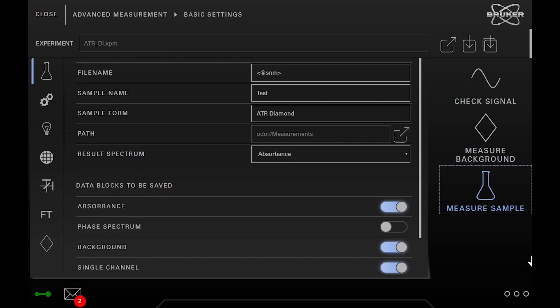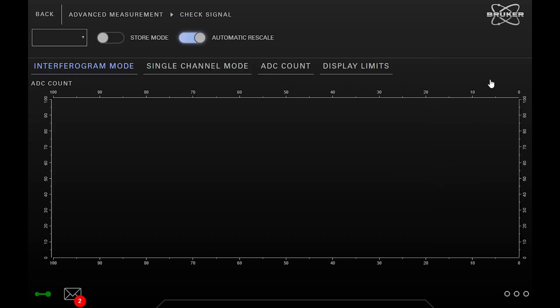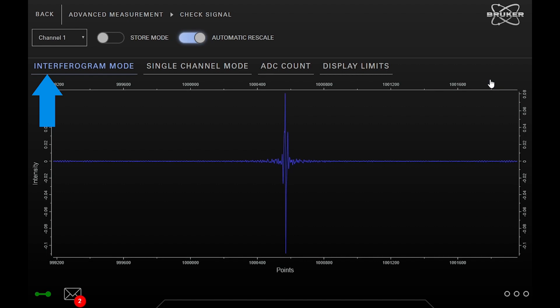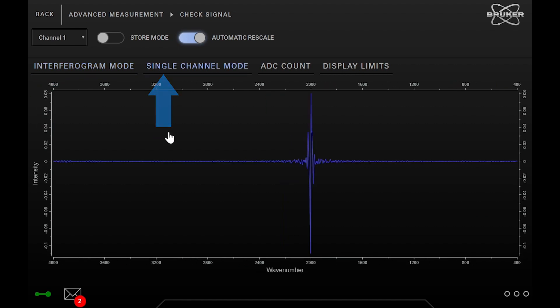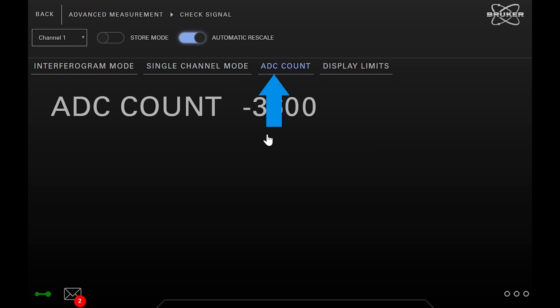Finally there is a check signal function where you can have a look at the live interferogram, the live single channel spectrum and the ADC value that gives you valuable information about the intensity of the detector signal, which can be used for alignment purposes.